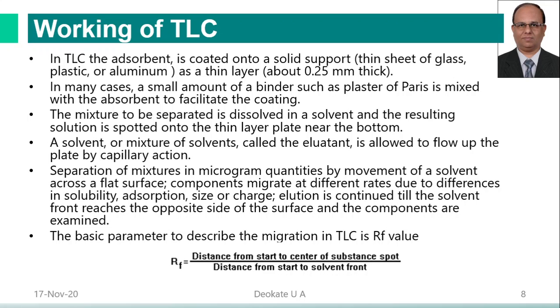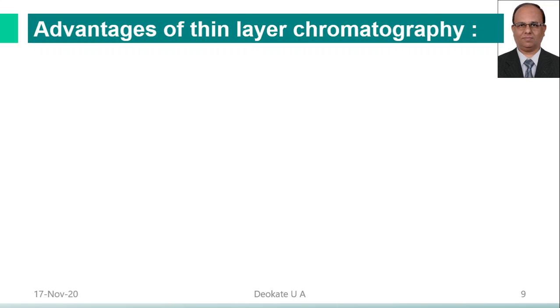Again, the same thing will be here. We cannot take the book value RF values for comparison purpose. Simultaneously, we have to spot the sample and the standard on the same plate in the same environment so that you will get the exact identification of the species.